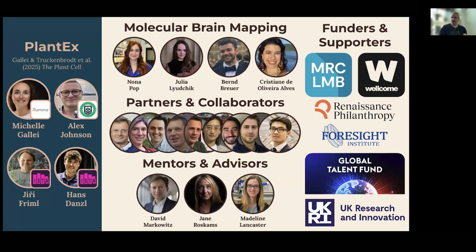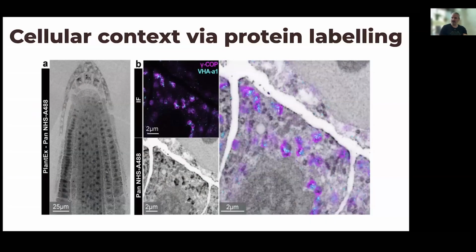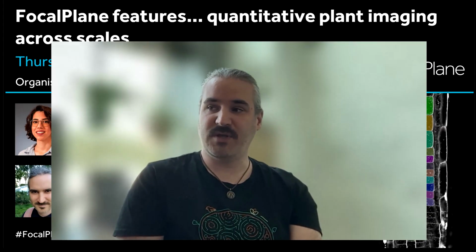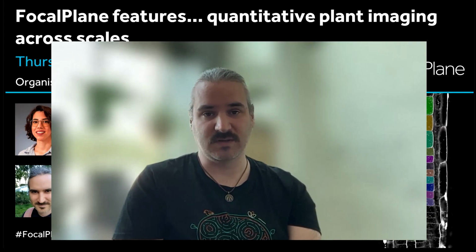The pictures that we showed here were obtained typically with a 40 to 60x objective with a working distance anywhere from 300 to 700 micrometers. So that is still enough to get the entire root visualized. But obviously, if you had higher expansion, you would need higher working distance.